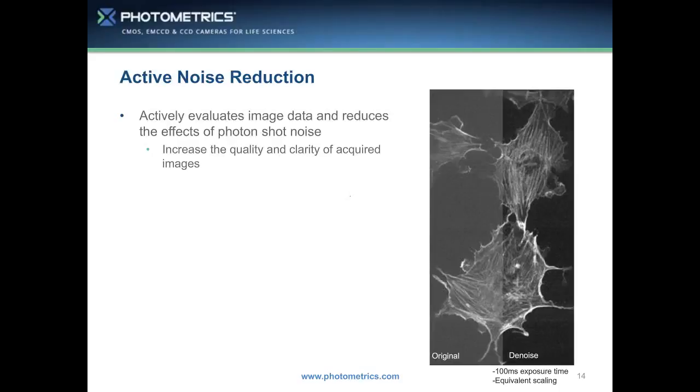If you think about how our eyes behave, when we're running a focus loop with a camera and looking at a feature, our eyes are great at removing the noise from the image. And this is quite easily seen when you're looking at a cell. You draw a line profile across some of the features, some of the filaments within, and you're able to see the structures but not necessarily measure them. That's because our eyes are able to filter out that high frequency noise.